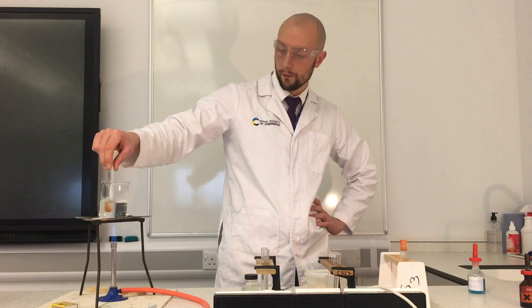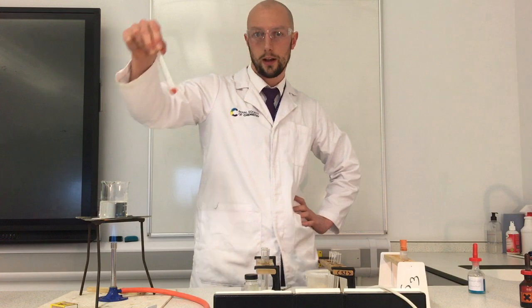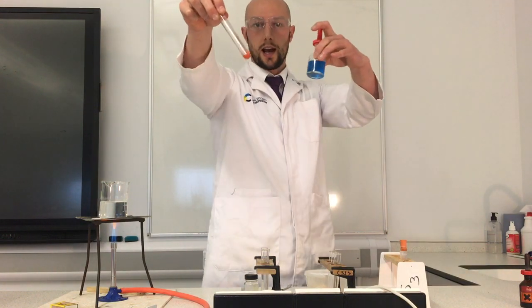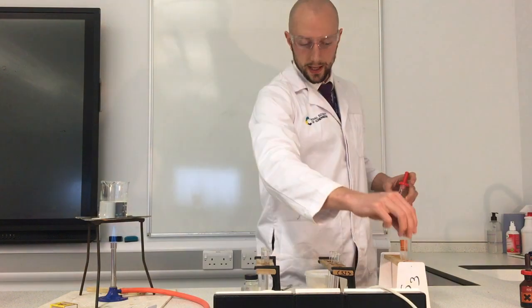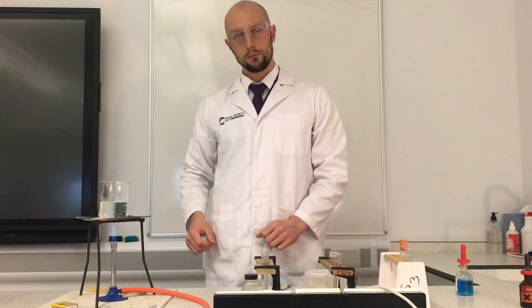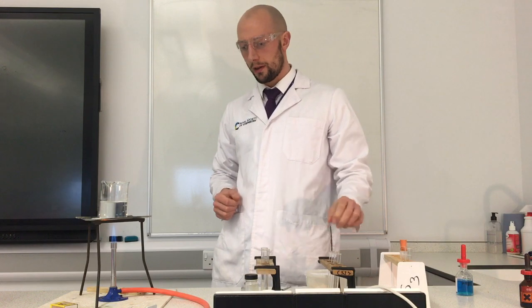And this is one of my favourite reactions because I'm going to take it out and you'll see it's gone red. It used to look blue, now it looks red. So that tells me that there is glucose in my energy drink powder. I've done the 3 food tests on energy drink powder, now I'm going to do it on some other things.